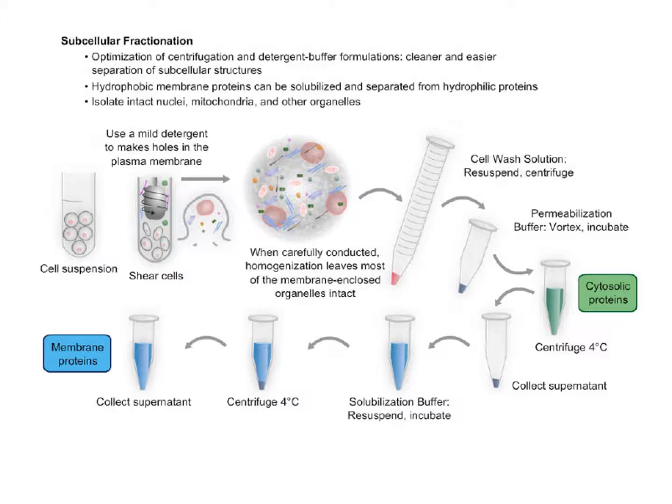Centrifugation is a tool of subcellular fractionation. Subcellular means below the cell. Fractionation, we have to optimize the whole process to get a clean, pure, quick separation. That's what we want to do.